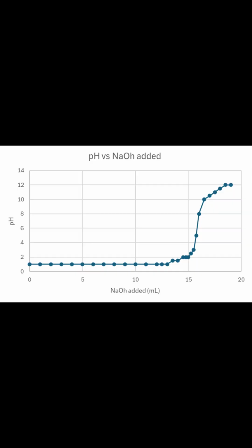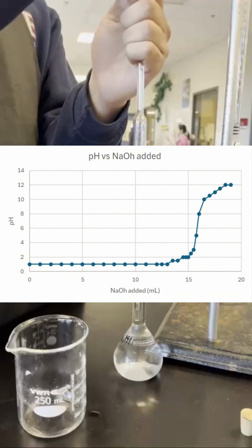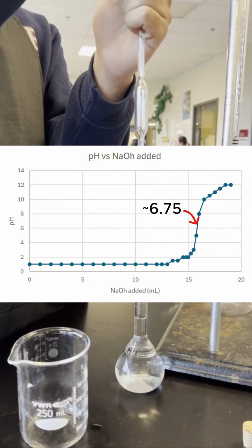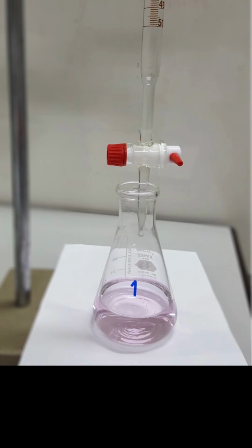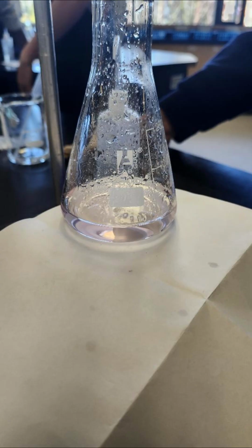Thanks to these measurements, we were able to determine the approximate location of the equivalence point and create a pH versus volume curve. During the titration, a pH of 7, the pH of pure water, is anticipated. Using the graph's midline, we determined that the true pH was approximately 6.75. The results of this lab support the expected behavior of a strong acid-strong base titration: a sharp curve, consistent volumes across trials, and minimal variation in calculated molarity.